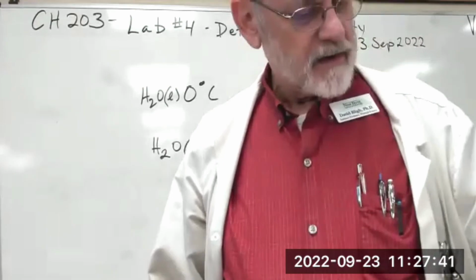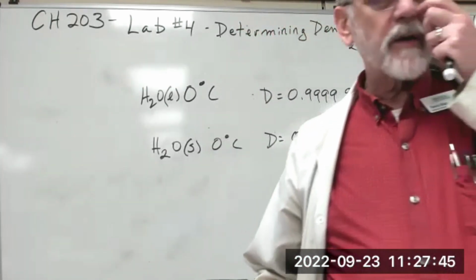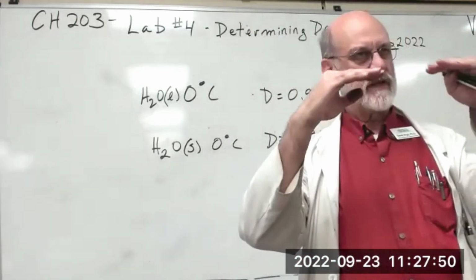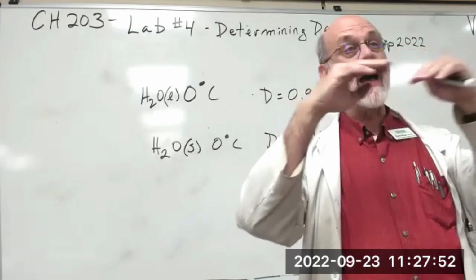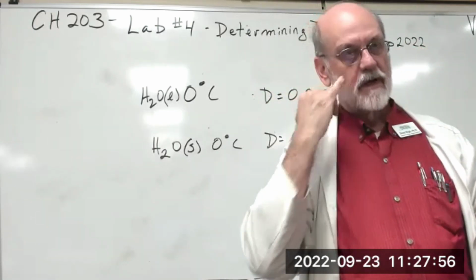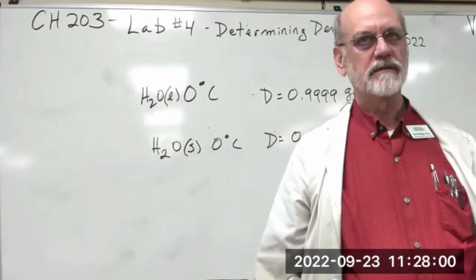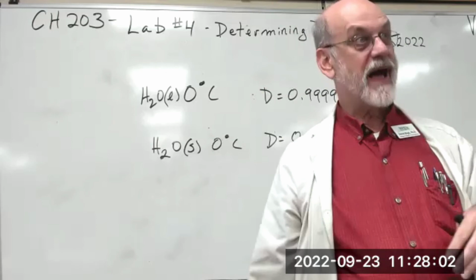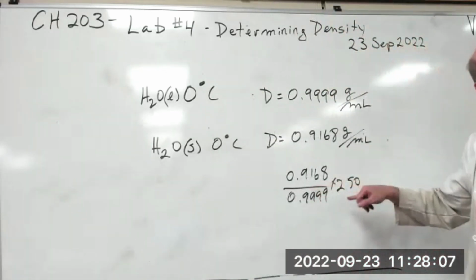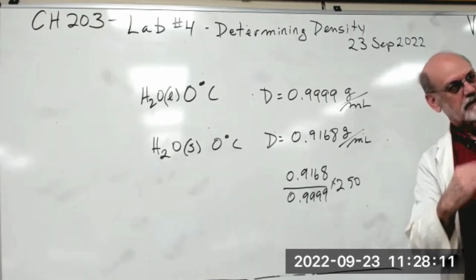And the last one says, if the water completely filled the container, say you had a container that's exactly 250 milliliters, and the ice was right at the top. So when it melts, what's it going to do? Is it going to spill over? No, it's going to shrink. By how much? The value you get here subtracted from 250 is how much it's going to shrink. Okay?